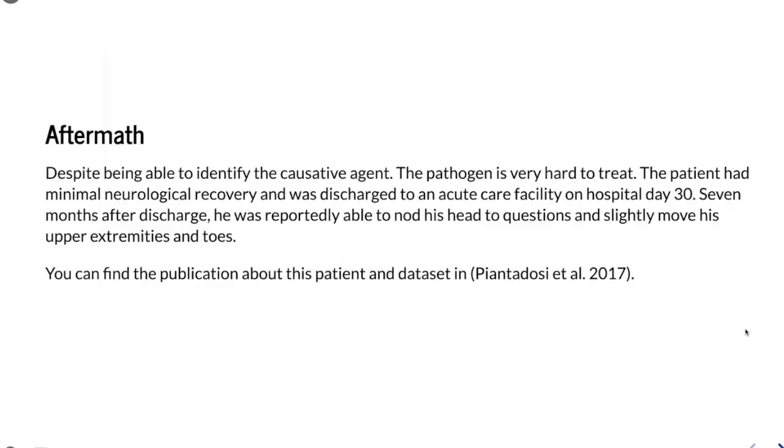Okay, so what happened? First of all, the Powassan virus that we talked about here was confirmed to be the causal agent of this patient. They could find it using these NGS methods. They used Kraken for their analysis, not MMseqs2. Kraken matched 270 reads, I think, to that. MMseqs matched 1,200 reads to the Powassan virus, meaning that there is a bit more sensitivity using the protein level matching over the nucleotide matching.